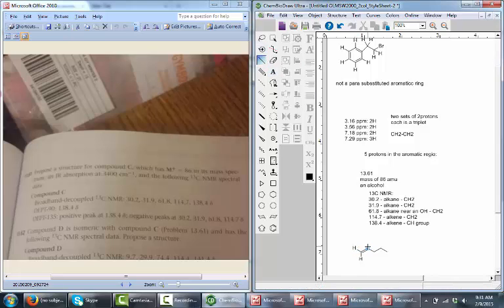That alkene also has a CH on it. And then in terms of the rest of my molecule, I'm looking at 3 CH2s. So in order to get 3 CH2s, I'm going to put the OH way at the end over here. And now let's just figure out if that gives me the correct structure. So I have now 3 CH2s, and I can figure that out from the DEPT, again, carbon experiments.